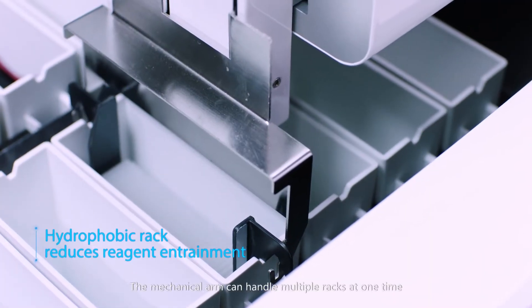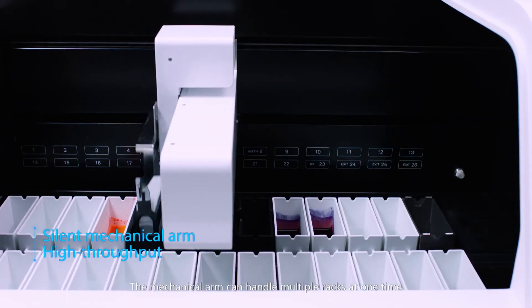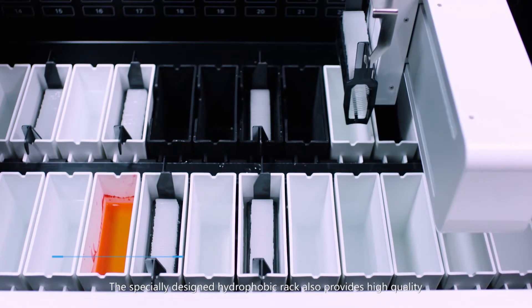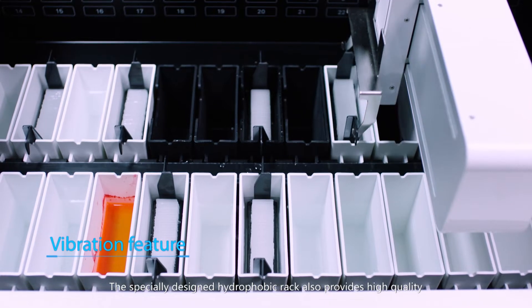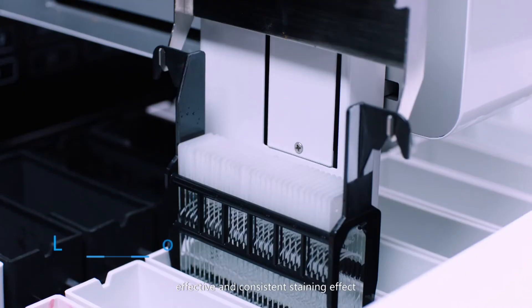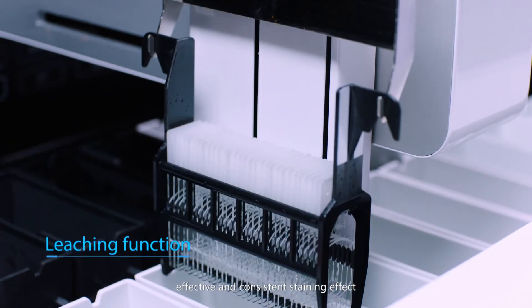The mechanical arm can handle multiple racks at one time. The specially designed hydrophobic rack also provides high quality, effective and consistent staining effect.